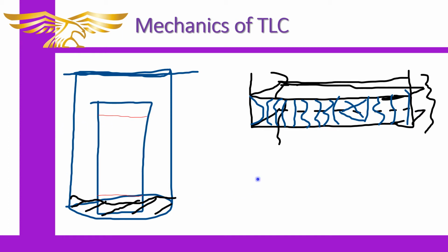It looks much like wetting a paper towel, how you can see the water change the color a little bit as it darkens the material. So you will notice the movement. And that's important, because you have to note where the solvent front stops in order to measure retention factors on the plate.